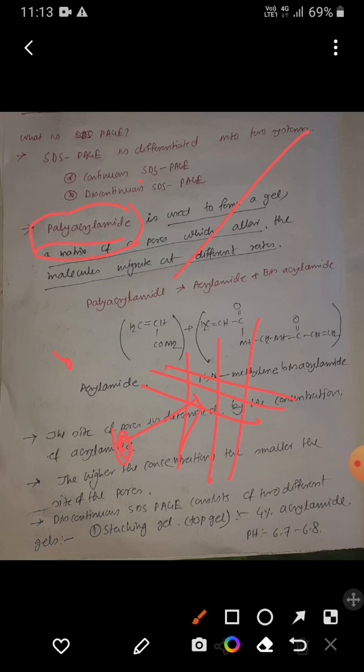Although if we have fragments of nucleic acid, in that case we can use PAGE. That is why during the DNA sequencing procedure we perform PAGE instead of agarose gel. We discussed this in our recombinant DNA technology section. The polyacrylamide gel provides a smaller pore size, which is more suitable for proteins, nucleic acid fragments and RNAs. But when you are dealing with a total DNA molecule, just go for agarose gel electrophoresis. Polyacrylamide gel cannot help you.